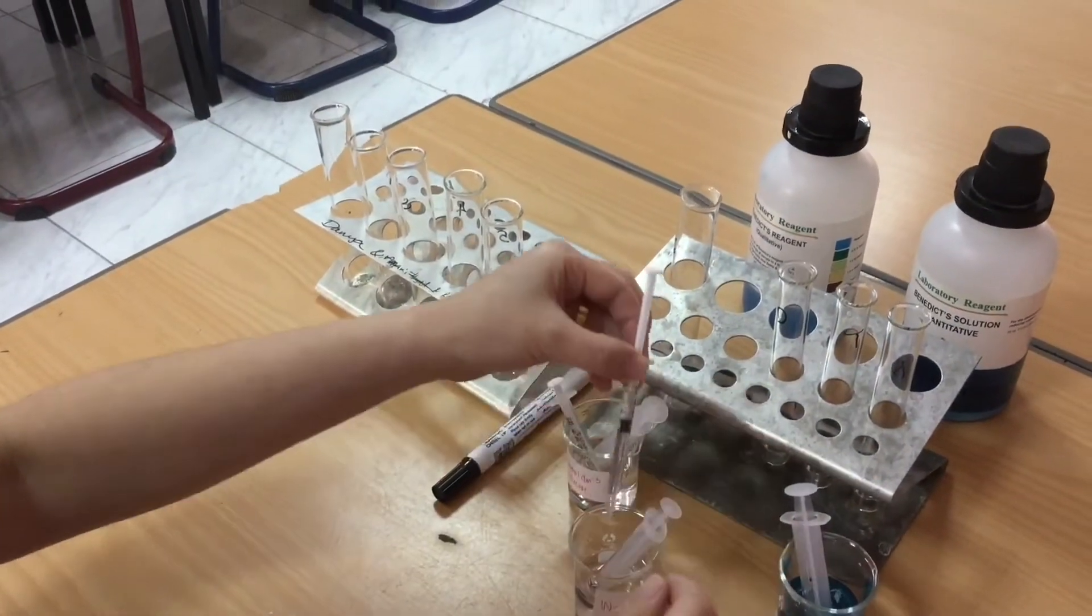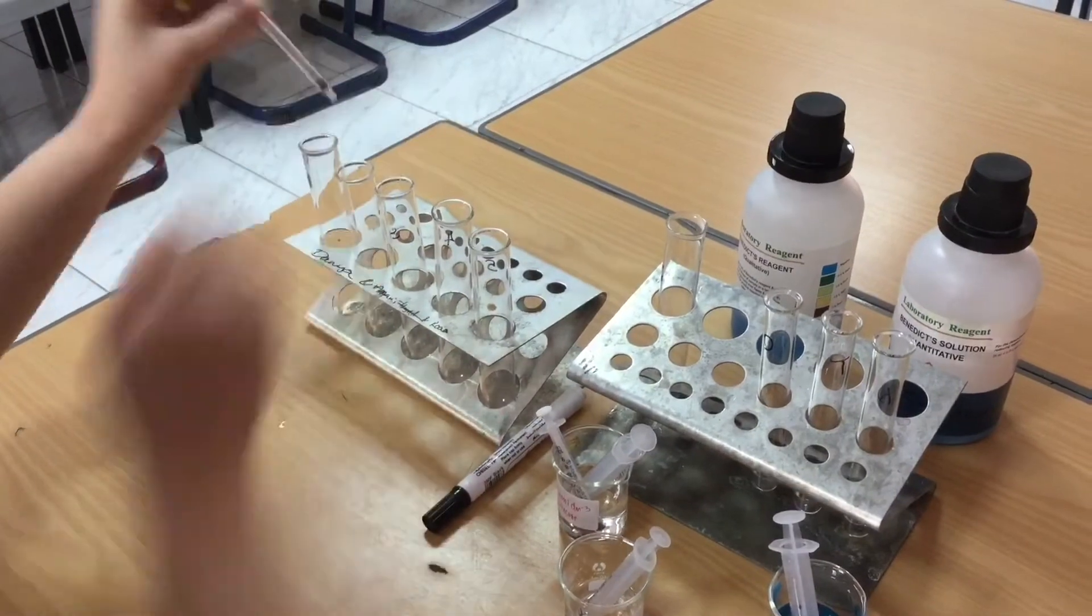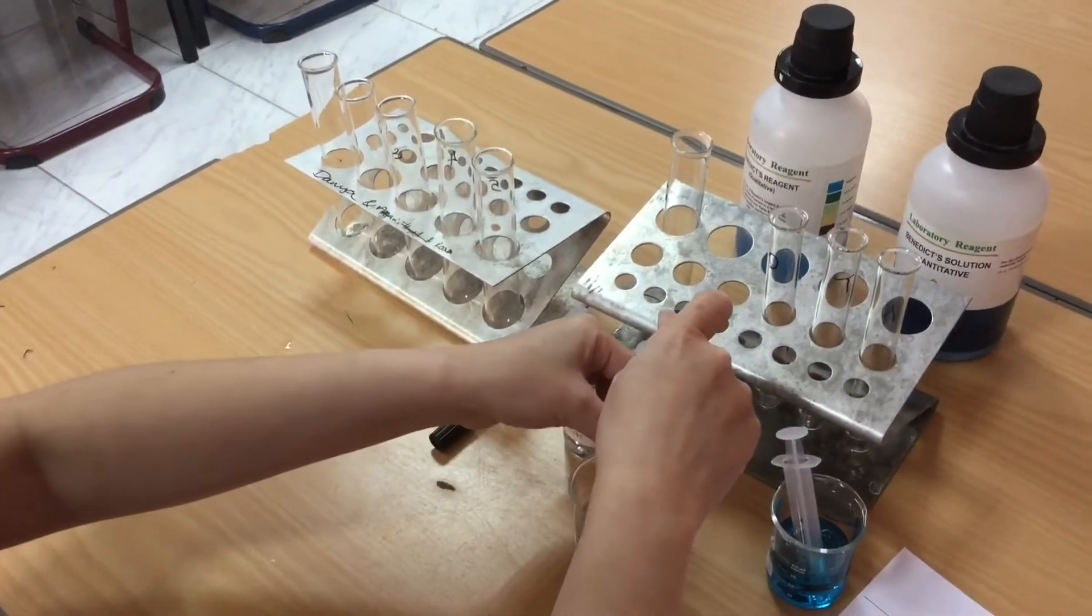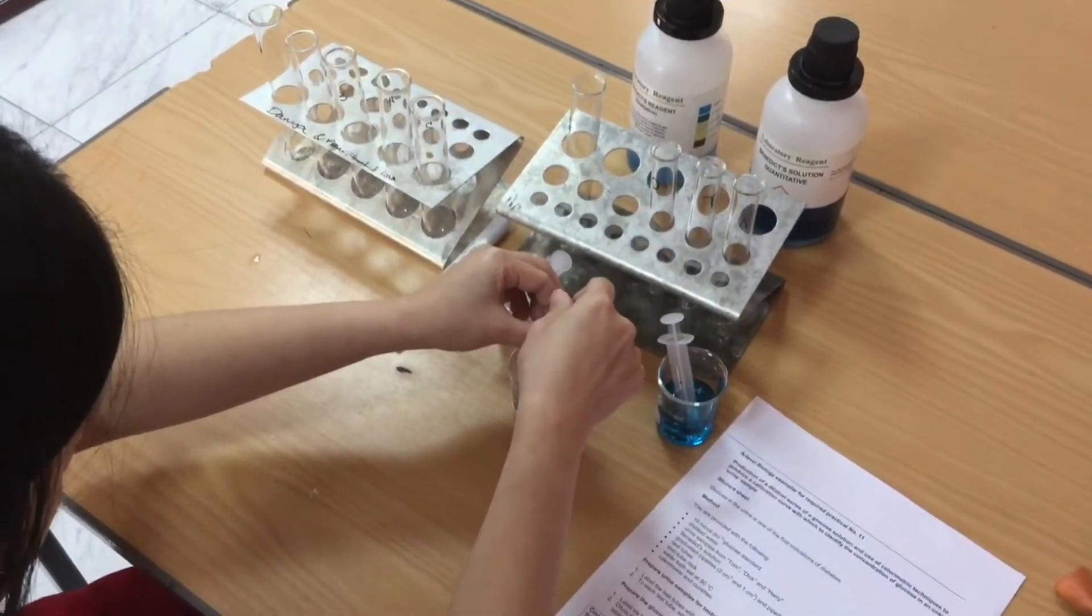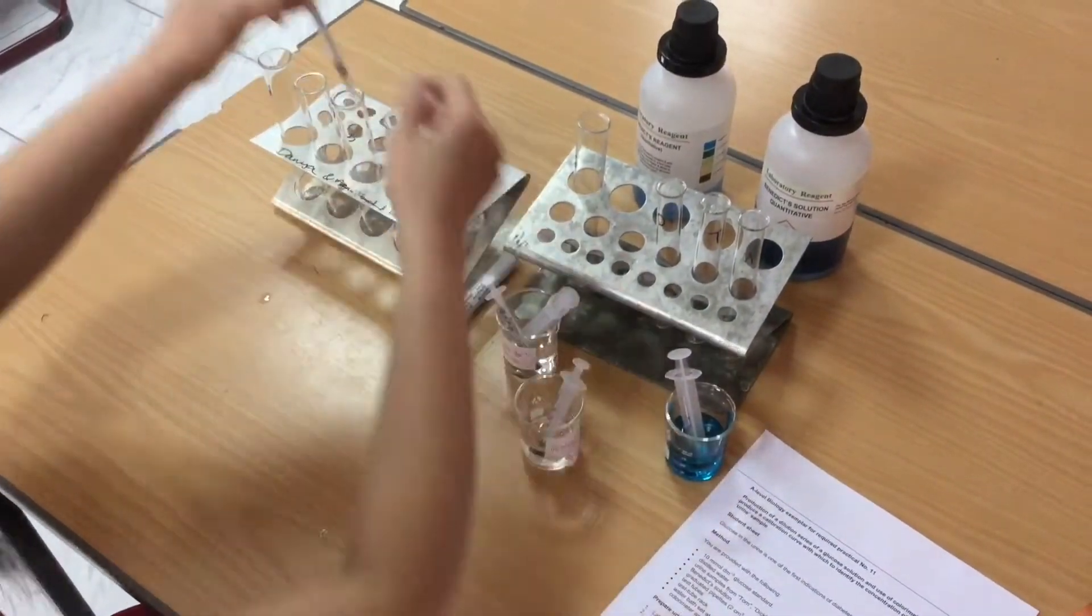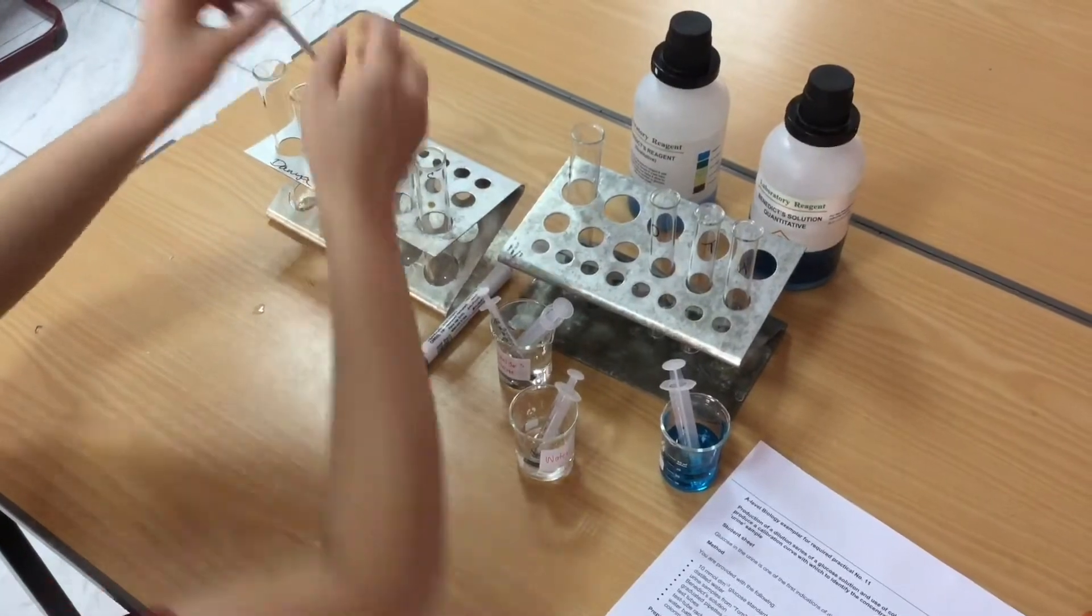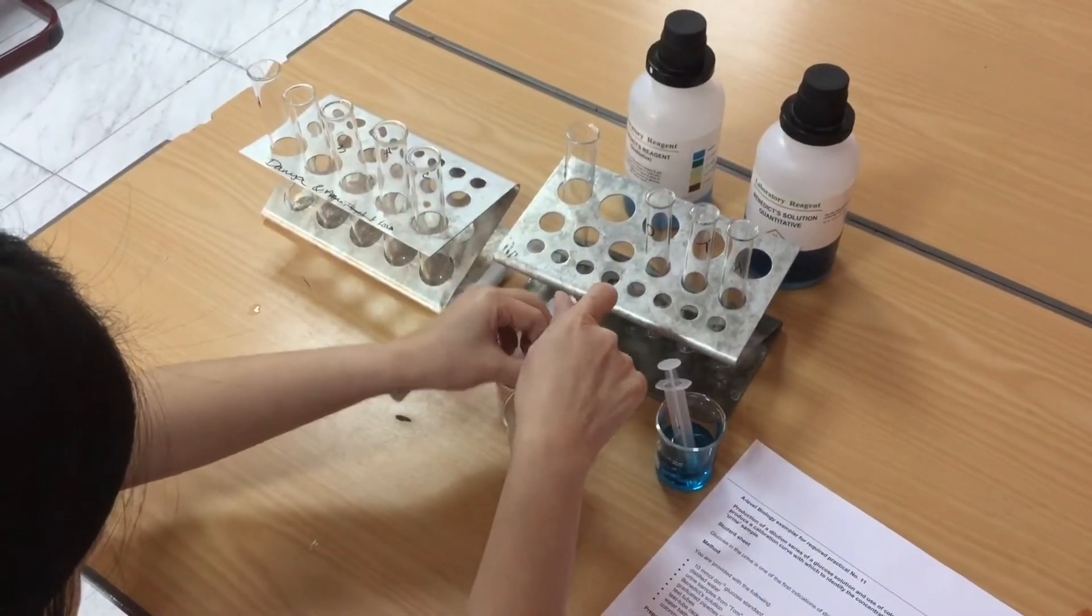In tube one I'll have two mils of water and no glucose. In tube two I'll have 1.6 mils of water and 0.4 of glucose. In tube three I'll have 1.2 mils of water and 0.8 of glucose and so on.